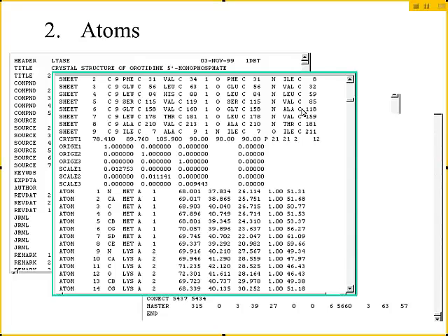Most often when you have a polymer chain, you know the occupancy has to be one, except for the case where the side chain adopts more than one conformation. Most of the time they may adopt two. The side chain goes this way and it goes that way. So it's this way 50% of the time, it's that way 50% of the time. Or sometimes you may see three different conformations. But if you have alternate conformations, then you start seeing duplicate sets of the side chain atoms.